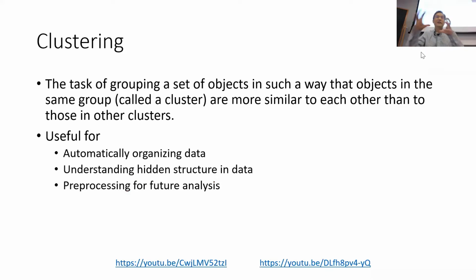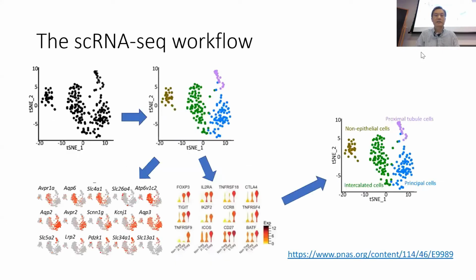If you have different clusters in your data, they won't be visible using the original data, but after clustering, you should be able to see them. So in single cell study, we do this at the pre-processing step. You remember in my laptop the MATLAB program, and last week we talked about dimensionality reduction. So you have a t-SNE embedding. The next step is to go from here to different colors. Different colors indicate they've already been grouped into different groups. So that's the next step.